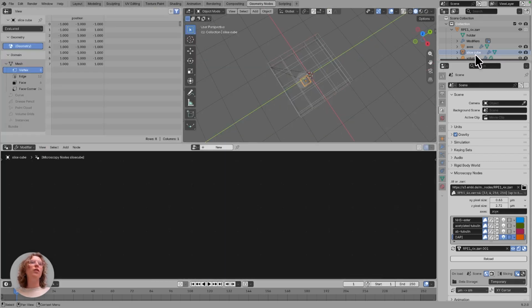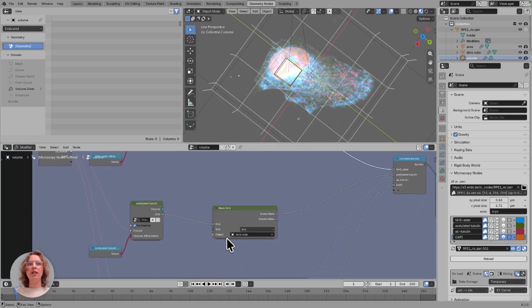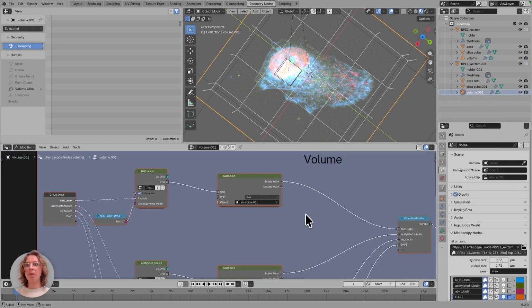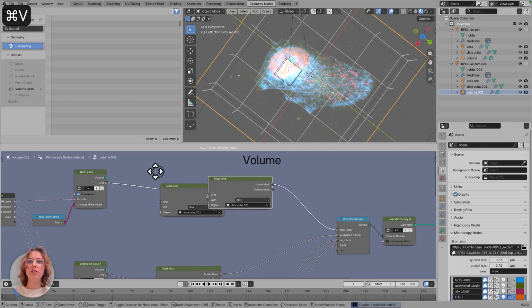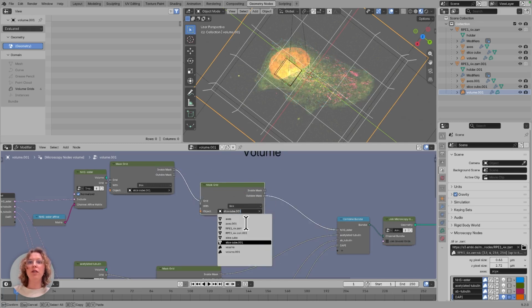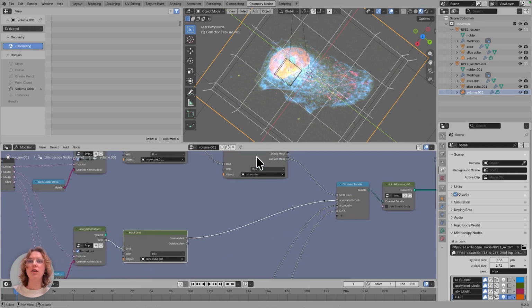So we can do much more of going back to what we learned in the masking tutorial. We can start to say, okay, let's only take for our new data set, which is the 0.001, another slice cube in series where we say it needs to be outside the first slice cube. And similarly, we can do that for all channels.